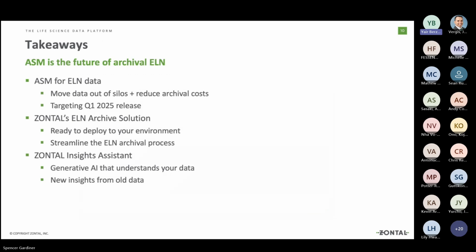All right, so key takeaways. First of all, ASM is the future of archival ELN. It moves your data out of silos. It's accessible, FAIR, standardized. It's pretty cool, and it's coming soon.